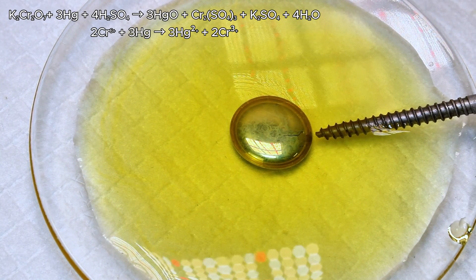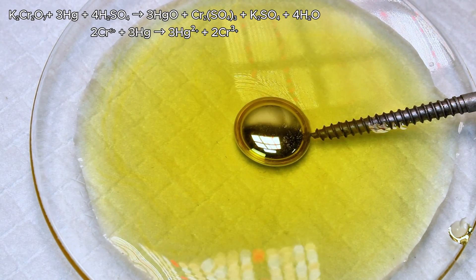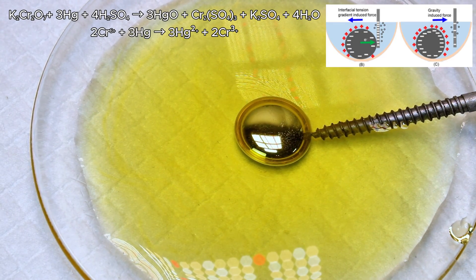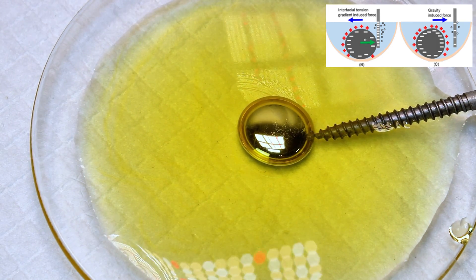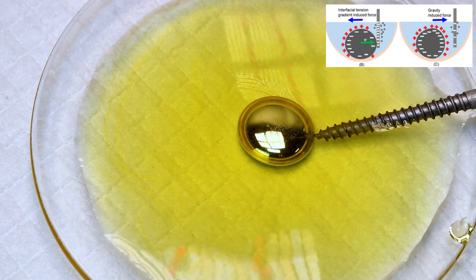Mercury has extremely strong surface tension, which causes it to bead up into a tight ball under normal conditions. However, the mercury oxide layer reduces this surface tension, which causes the ball to flatten out a bit.